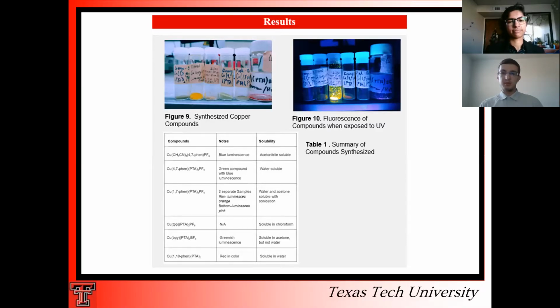One of the major problems that we've had so far while synthesizing all these products is that we're not sure if our reactions were carried out successfully, so we don't know if the product that we wanted to obtain is actually the product that we obtain, or if there have been other side reactions that produced other undesirable products. We've noticed this in some of the experiments that we've done, such as TLC, thin layer chromatography. We would try to separate the products based on their polarity, and we've noticed that many of the products have more than one product within them. So it would separate into different bands on the TLC, indicating that there are impurities.